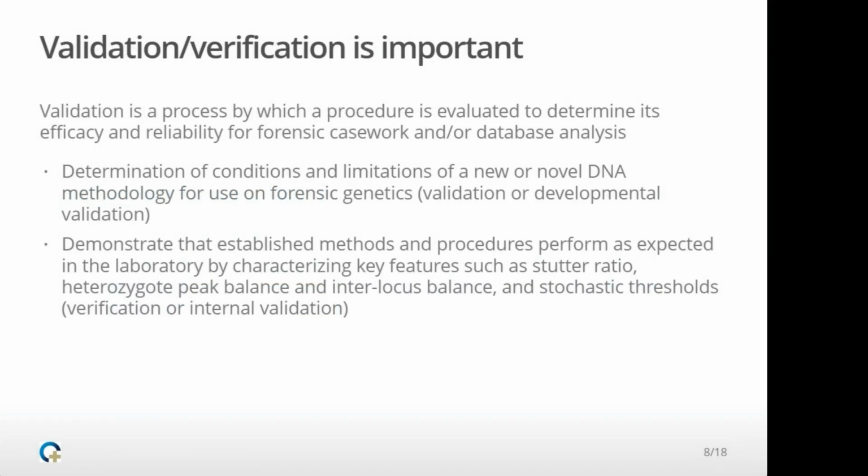Validation is a process by which a procedure is evaluated to determine its efficacy and reliability for forensic casework and/or database analysis. It's a determination of conditions and limitations of a new or novel DNA methodology for use on forensic genetics. And it is referred to as validation or developmental validation.